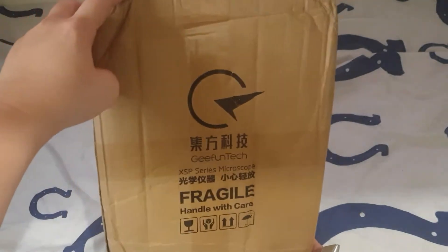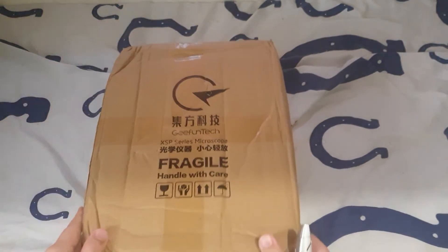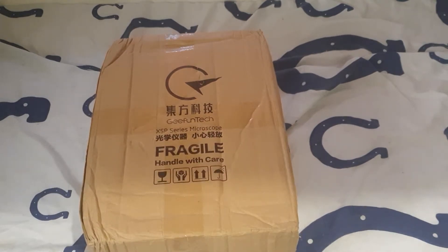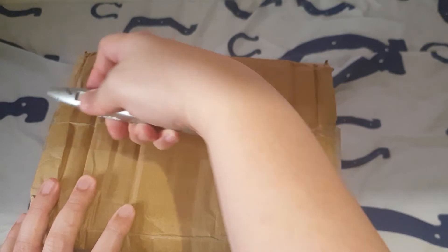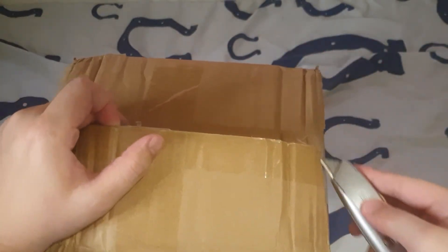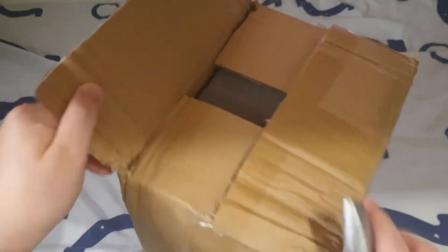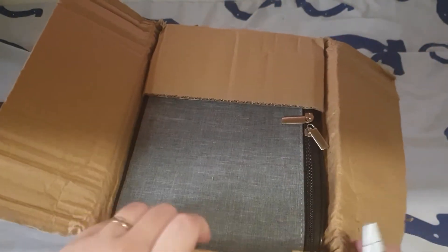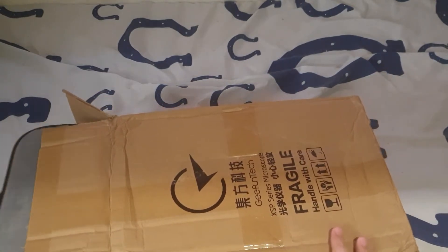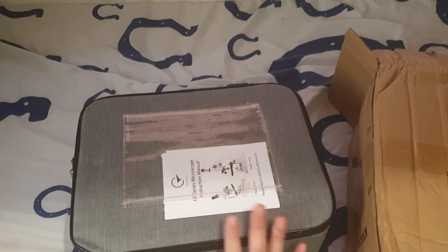Hi guys, quite a big box we have here today — the G-Fun Tech XPS series microscope. It's probably one of those brands from China; I did buy this on Shopee. We just got interested in microscopes — we bought a telescope and suddenly got interested, so hey, why not buy a microscope? We ended up buying one. This is the box it came in from Shopee, so let's see what we've got here.